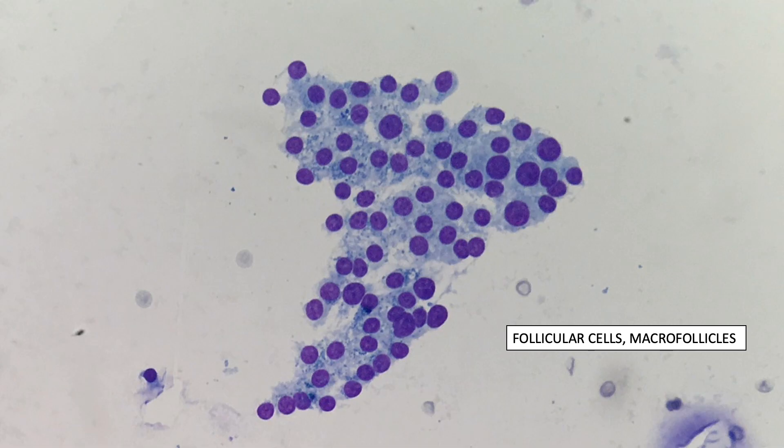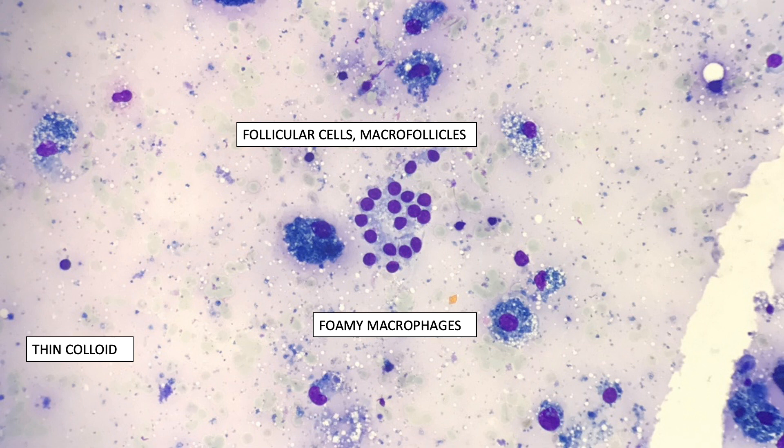Here in the Diff-Quik stain we can see the micro follicles and a slight granularity of the cytoplasm of those cells, which is very common in these benign elements.